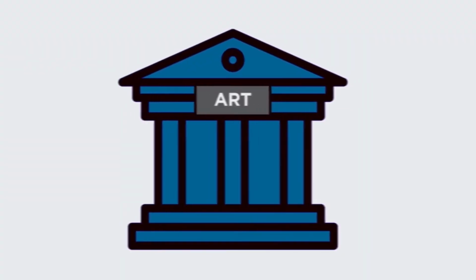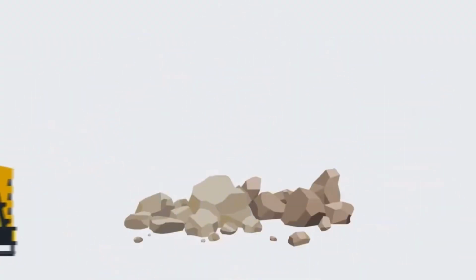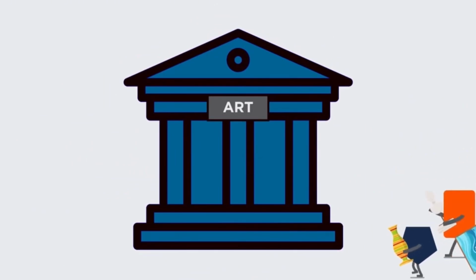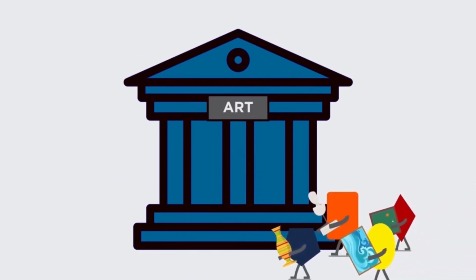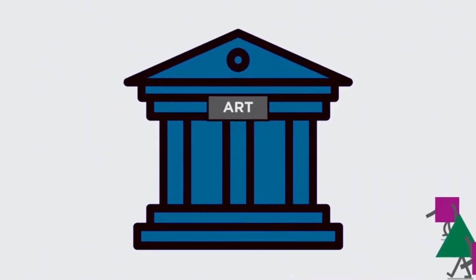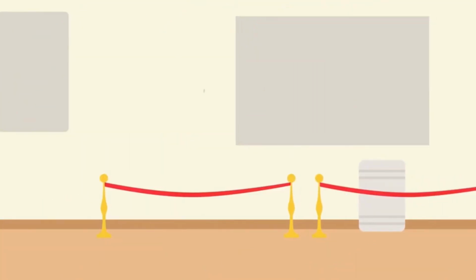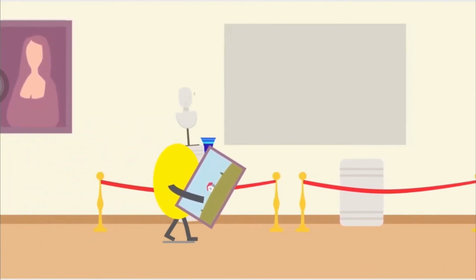In our museum analogy, that means demolishing the museum, constructing a new one, filling it with new art, and letting people in, knowing that each time you'll have to repeat the process again. With CPC, this problem is much easier to address. Imagine the same art museum, but in order to remove those art aficionados, each night the museum cleans up by flushing out everything that's left inside, and refilling with new pieces for the next day's patrons.